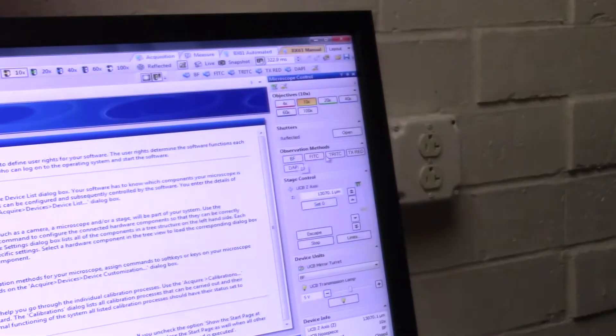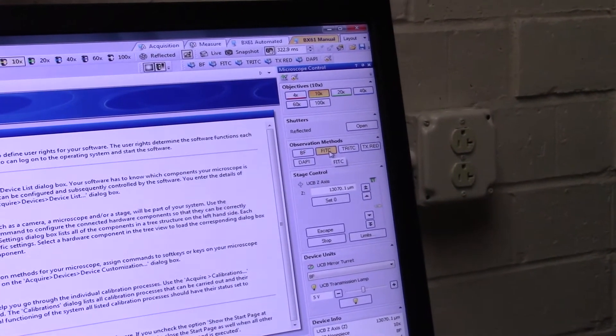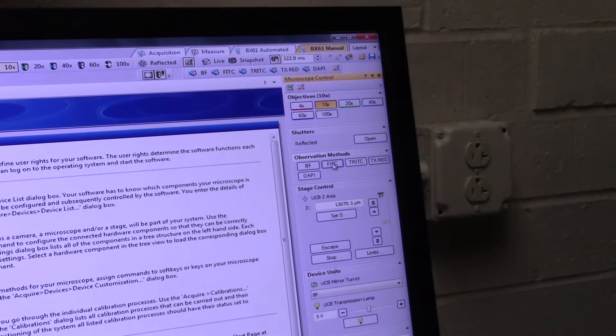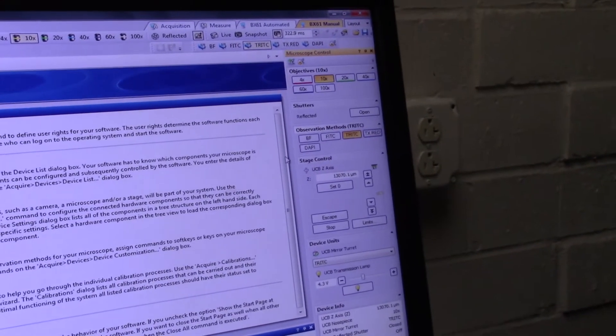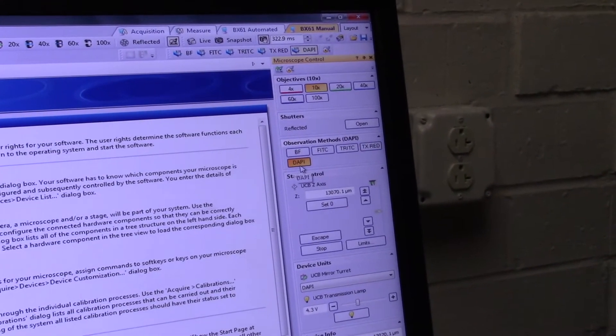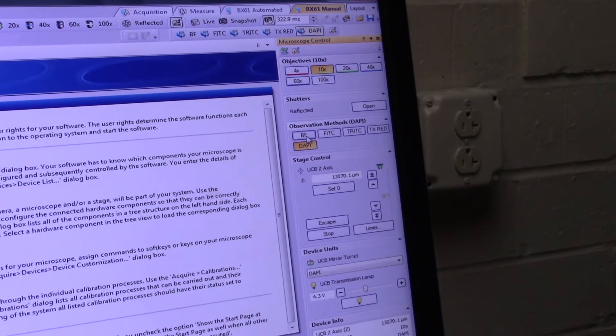Let's say I wanted to change what color of light I am letting through from our light source. FITC would let green light through. TRITC gives red or orange light. Texas Red gives very deep red. DAPI lets us see the blue. And bright field is where we're going to start.